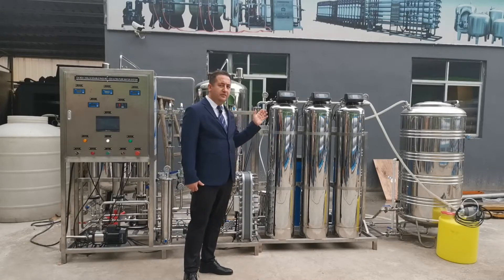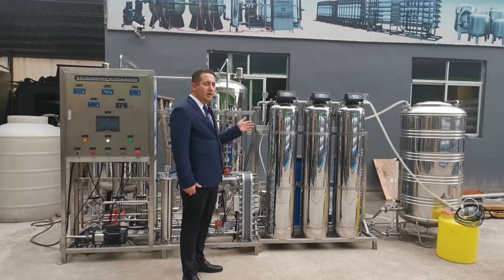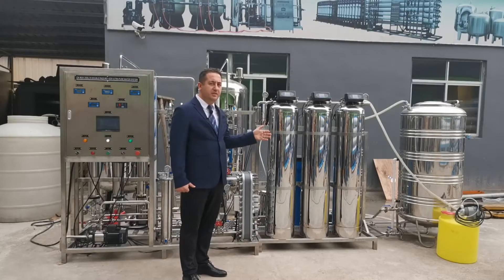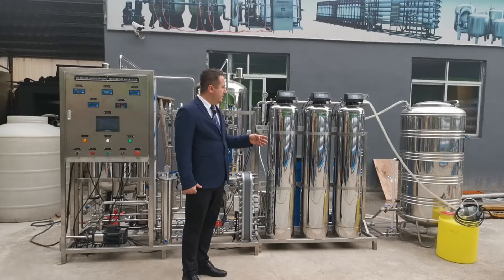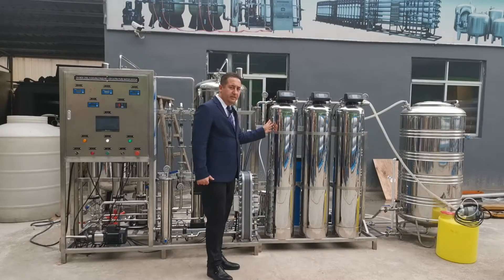The feed pump pumps the water to our pretreatment systems. In the pretreatment systems we have sand filter, activated carbon filter, and resin filter.